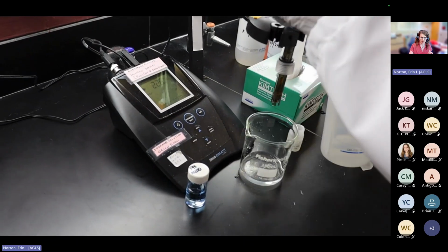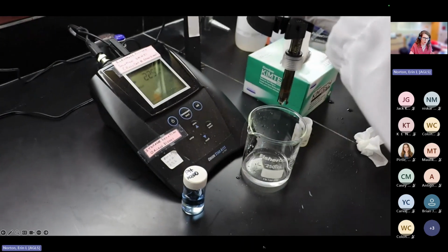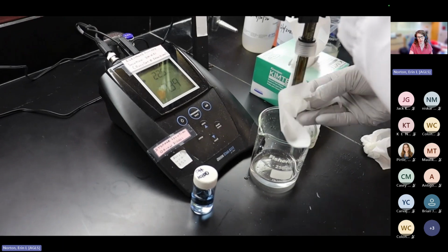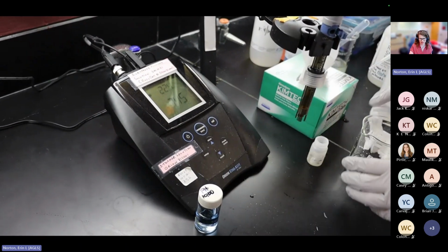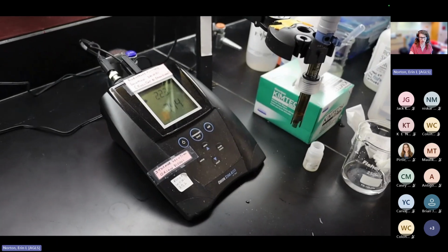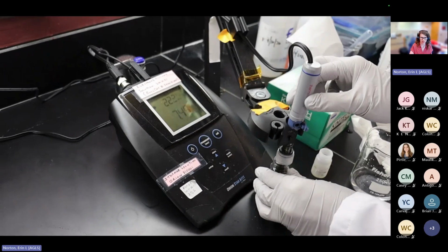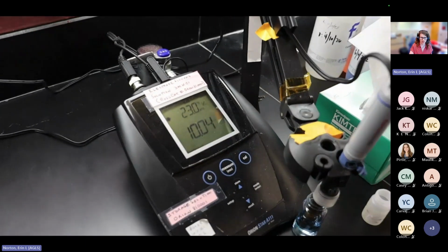Okay, we're gonna clean that one more time. And I know this seems tedious, but you're doing this once a day, okay? And it is very important to do this. pH meters, like I said, they can drift very easily from day to day. You want to make sure that you are calibrating with the same calibration solution on a daily basis. So now we're calibrating with our last.